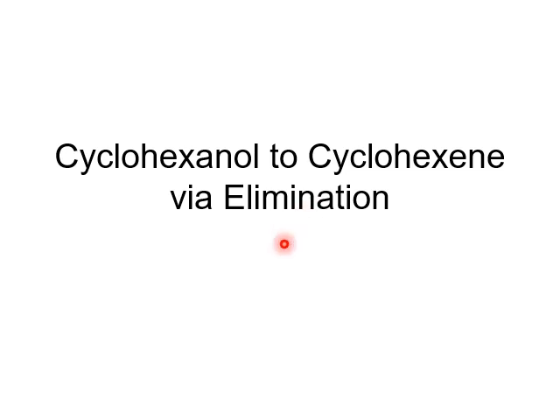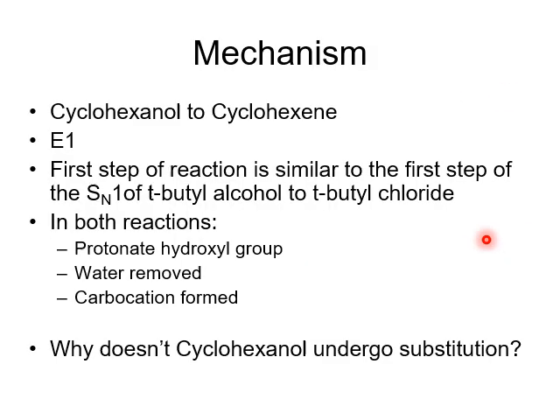Hello everyone. Your experiment today is an elimination reaction. Synthesis: I have cyclohexene from cyclohexanol. So the reaction is an E1 reaction.